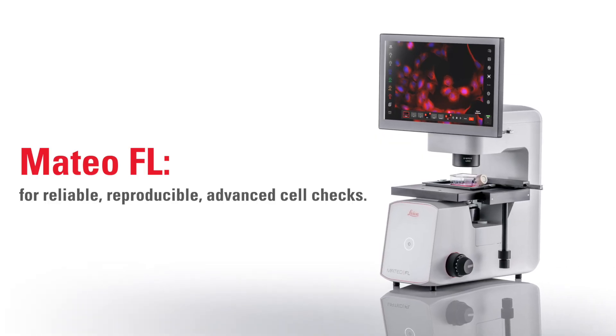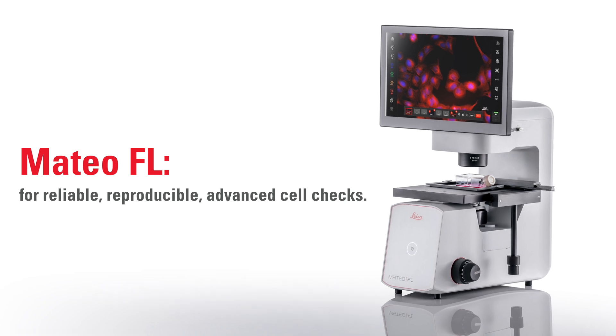Mateo FL, for reliable, reproducible, advanced cell checks.